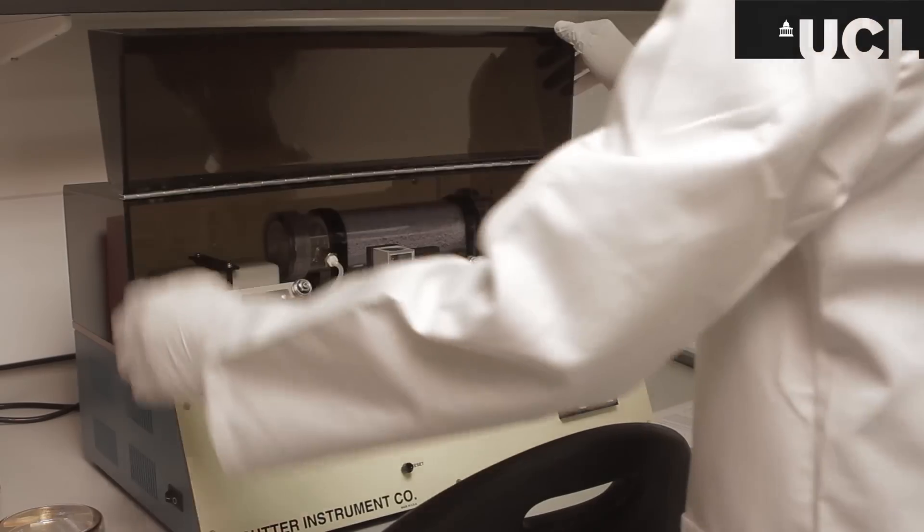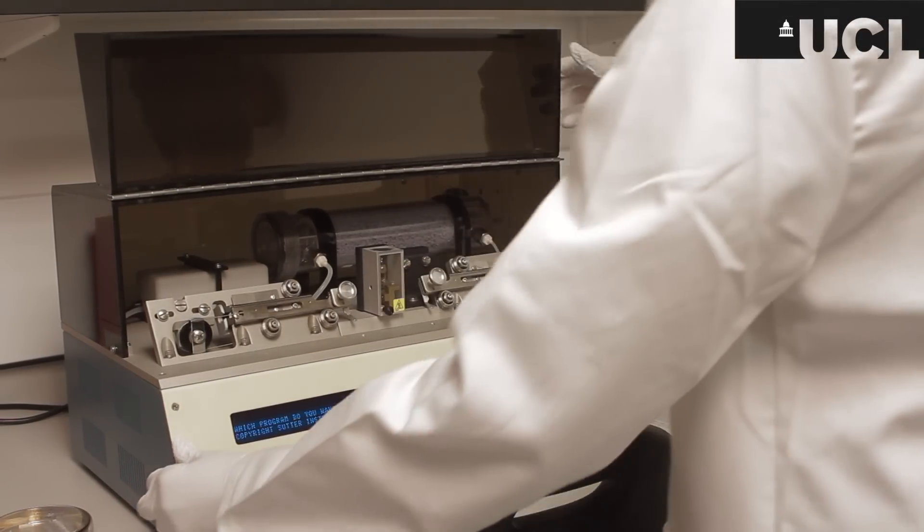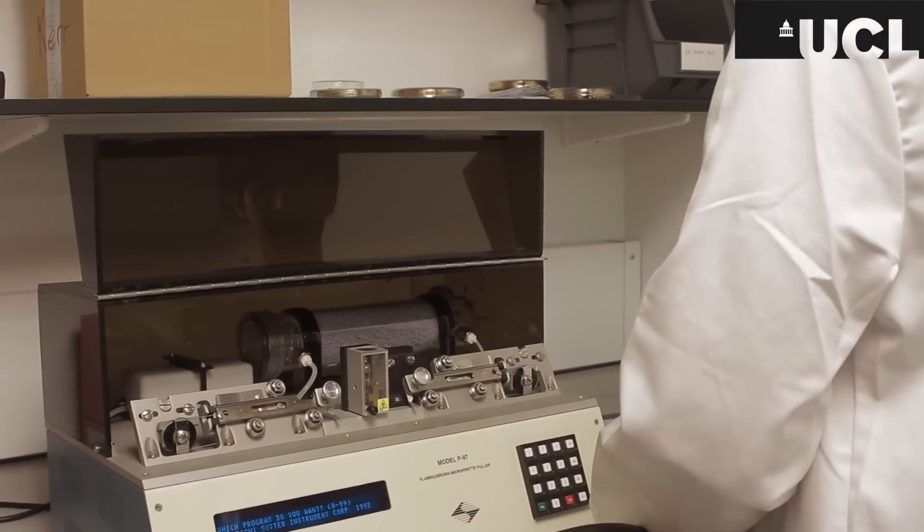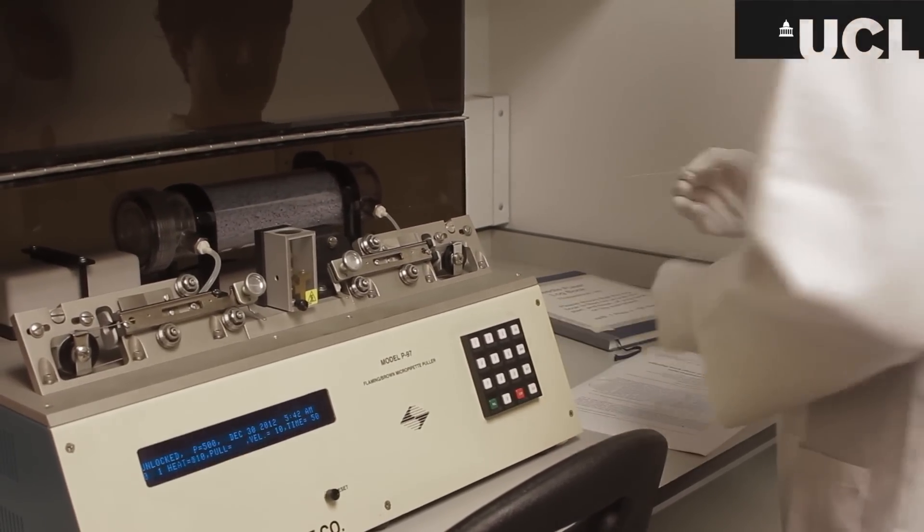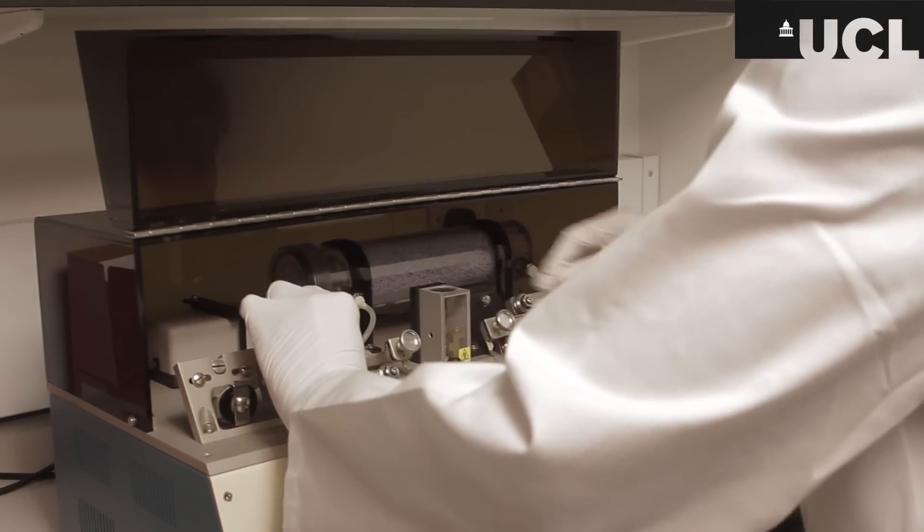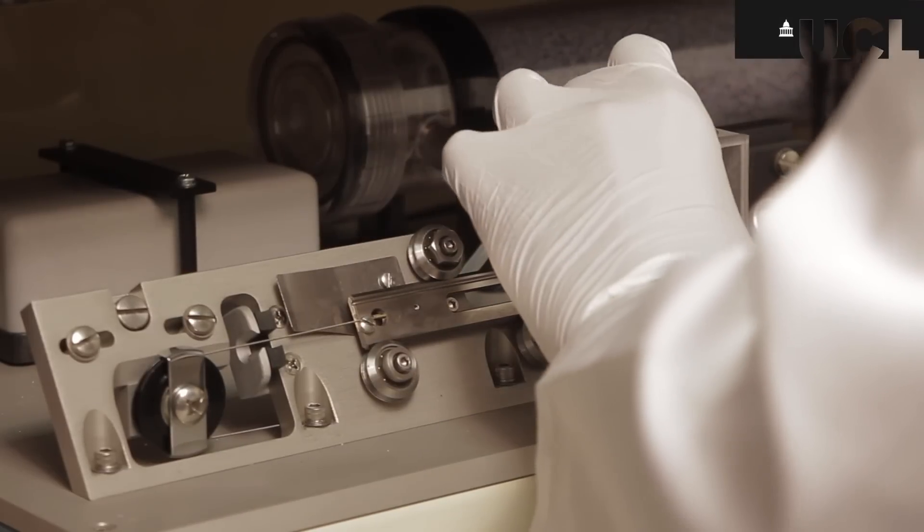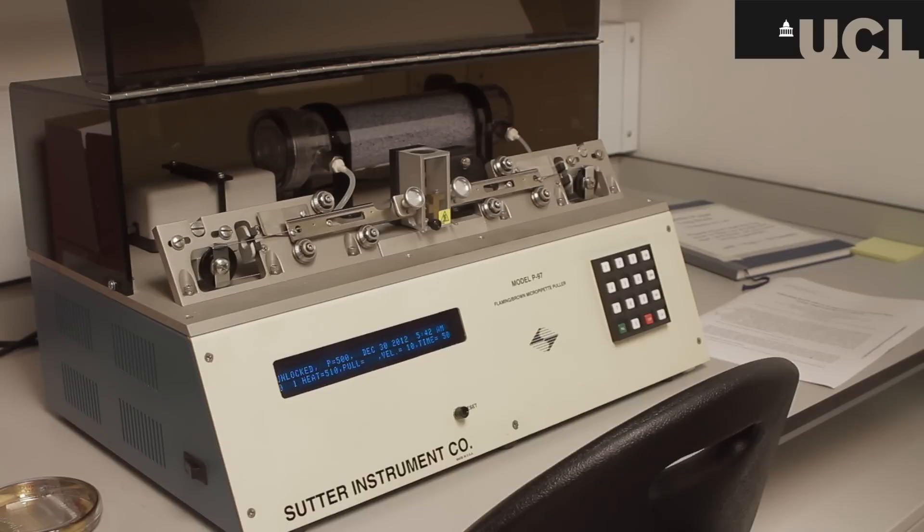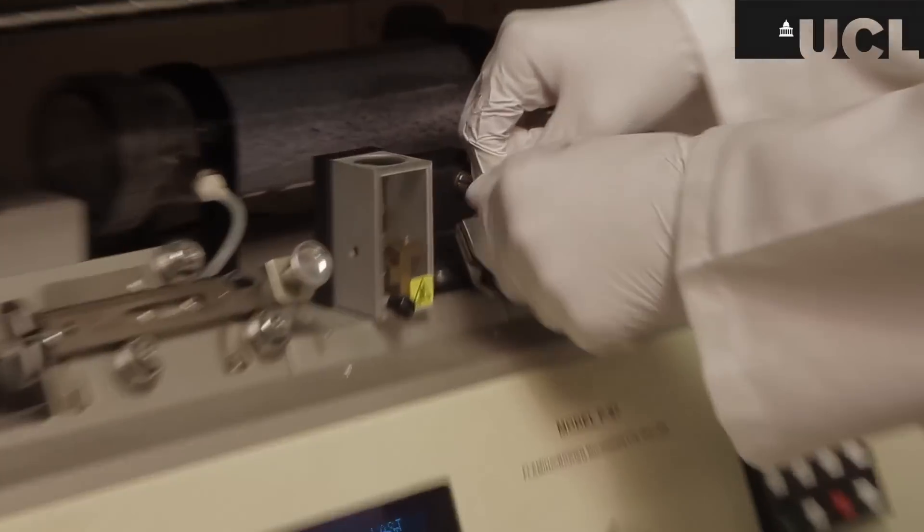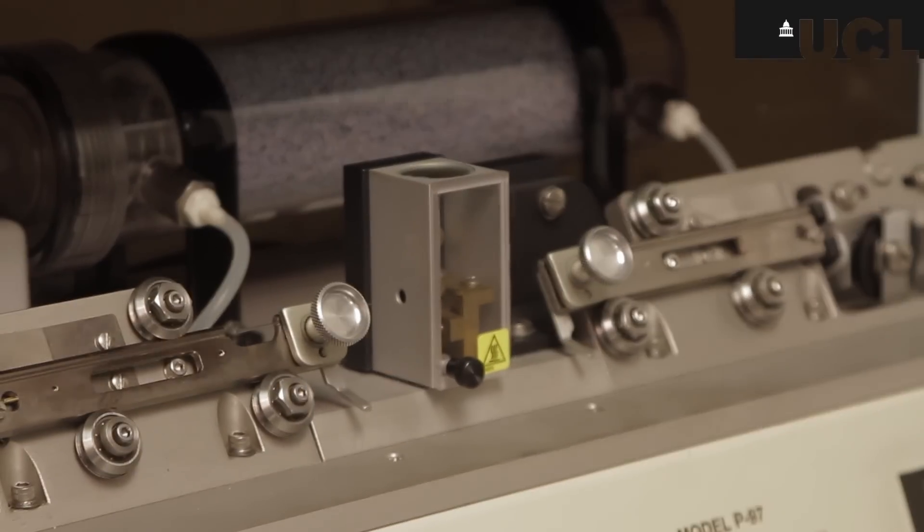So this is the needle puller. We will need this to pull needles from borosilicate glass capillary tubes. One tube will be put in through one side and locked to the other side with a metal filament that heats up to a considerable temperature. The filament in the middle goes red hot three times before finally pulling the capillary tubes apart and then you have two electrospray needles.